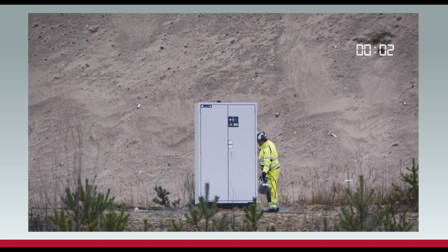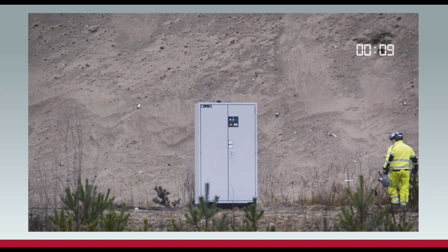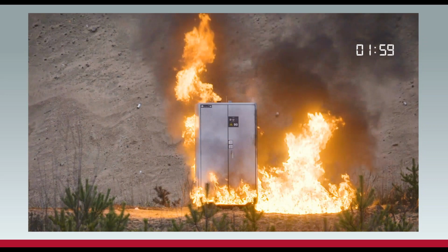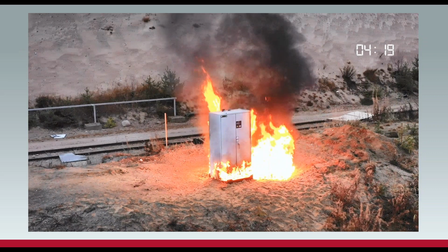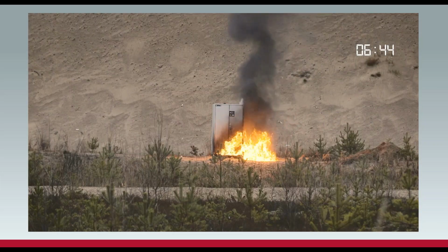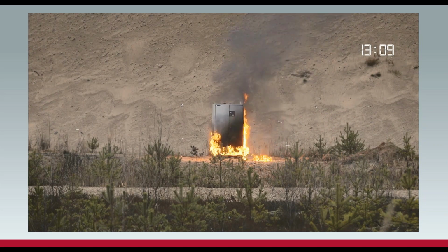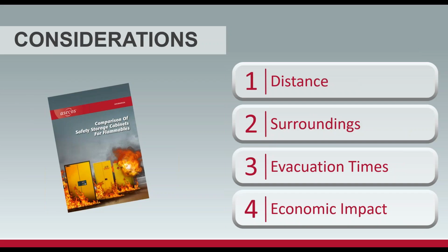I'm going to save your time. Here we are at 2 minutes prior to, so I'm going to move on. This cabinet's going to burn for 90 minutes. It's got a 90-minute fire resistance on it as well. And the fun thing, and I'm going to ask this question at the end, if you get it in your mind and you want to answer via chat: what happens after 90 minutes, and this thing doesn't blow up? I'm not walking up to it. I can promise you nobody on the call would walk up to it. So what do you do at that point? How do you get this to either go out, not a good option, or blow up? If you've got an answer, put it in the chat.